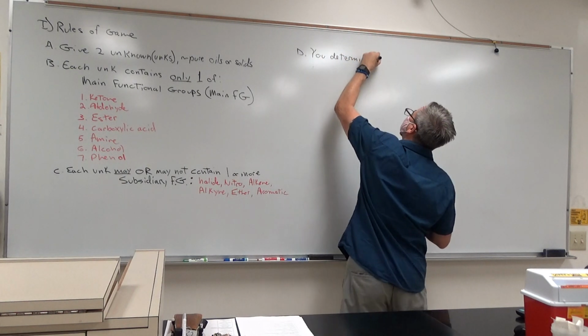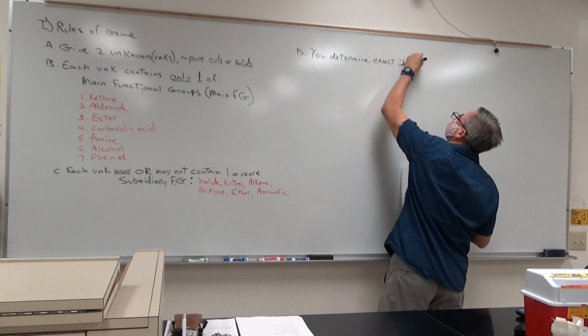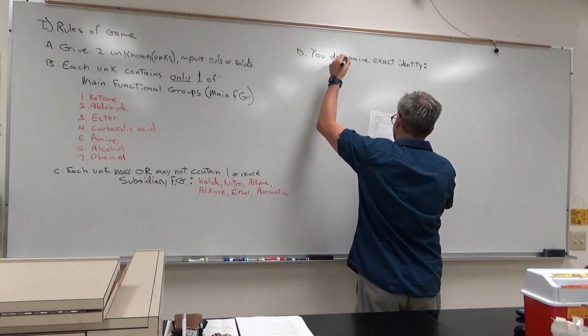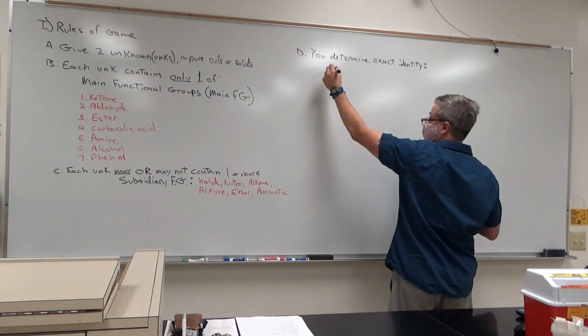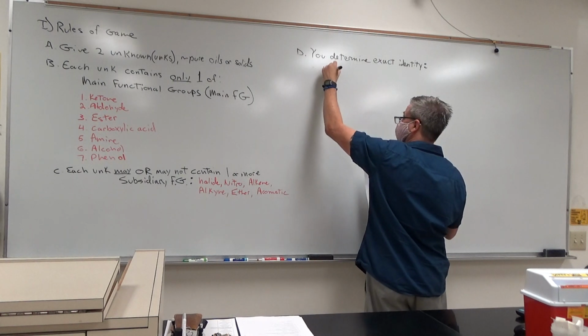You determine the exact identity of your unknowns using physical tests.